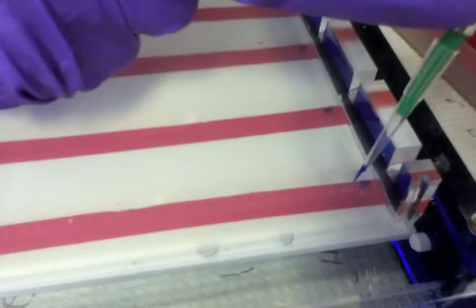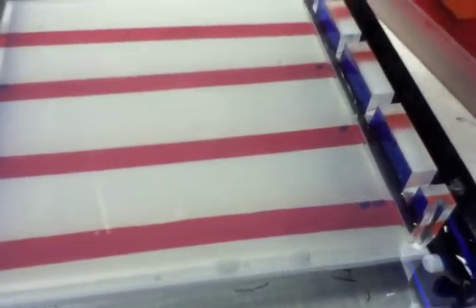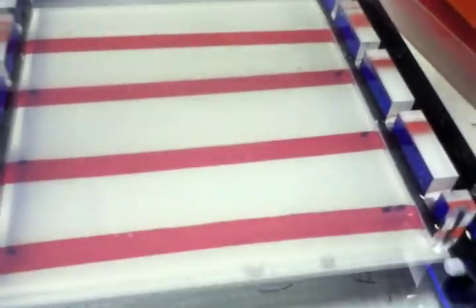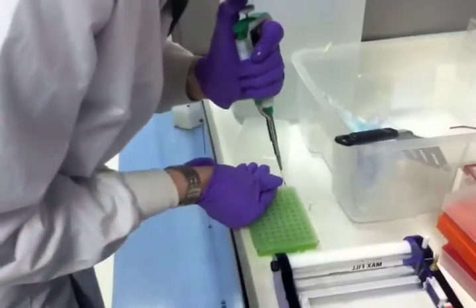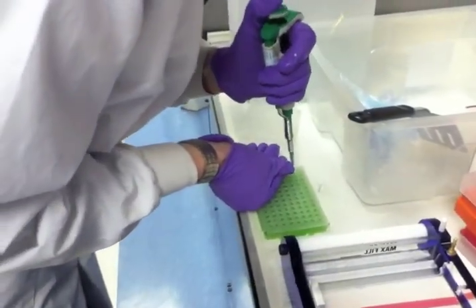Mixing loading buffer in with each PCR reaction, taking a small aliquot of that reaction and loading it in the gel. One down, 59 to go. There's a few.